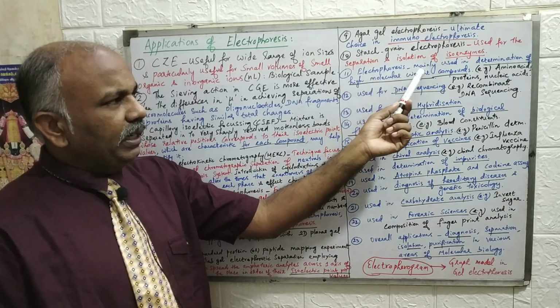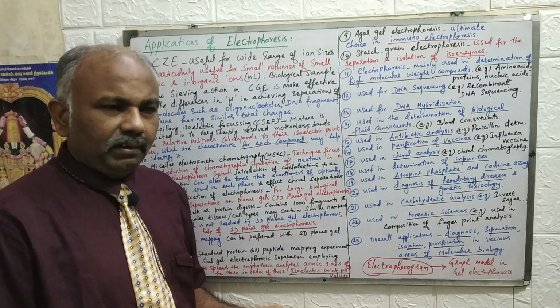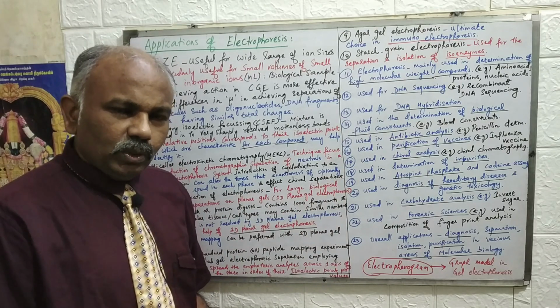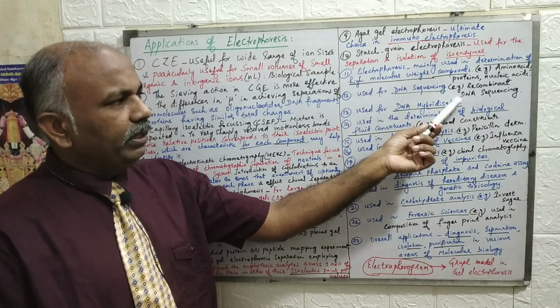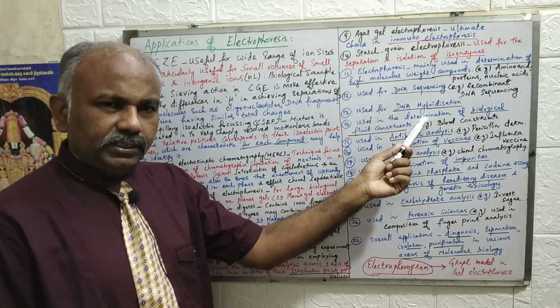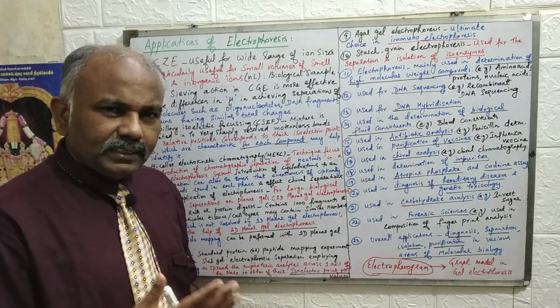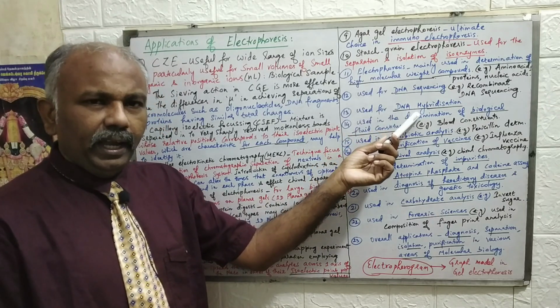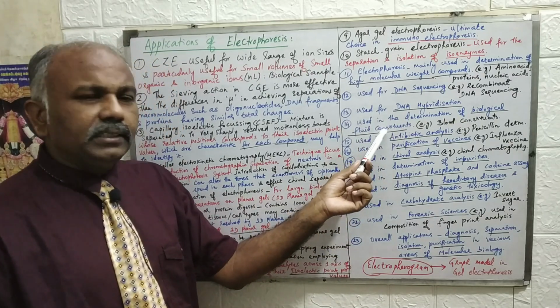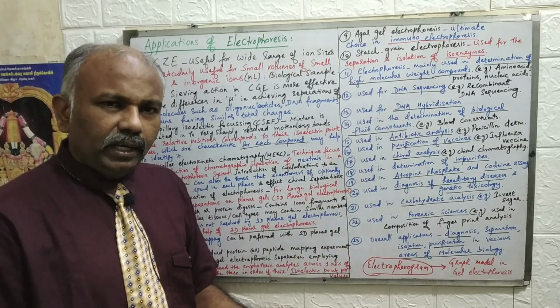Now electrophoresis is mainly used in the determination of high molecular weight compounds like amino acids, proteins, nucleic acids, etc. The same technique can be used for DNA sequencing also. One example of DNA sequencing is recombinant DNA sequencing. Electrophoresis is also used for DNA hybridization. Some platform tools, like micro hybridization array technologies, are used. So in all these cases we are using electrophoresis for DNA hybridization, the same as the microarray technique. Again, it is used in the determination of biological fluid constituents, for example blood constituents. If you want to analyze blood constituents, again you can go for electrophoresis.